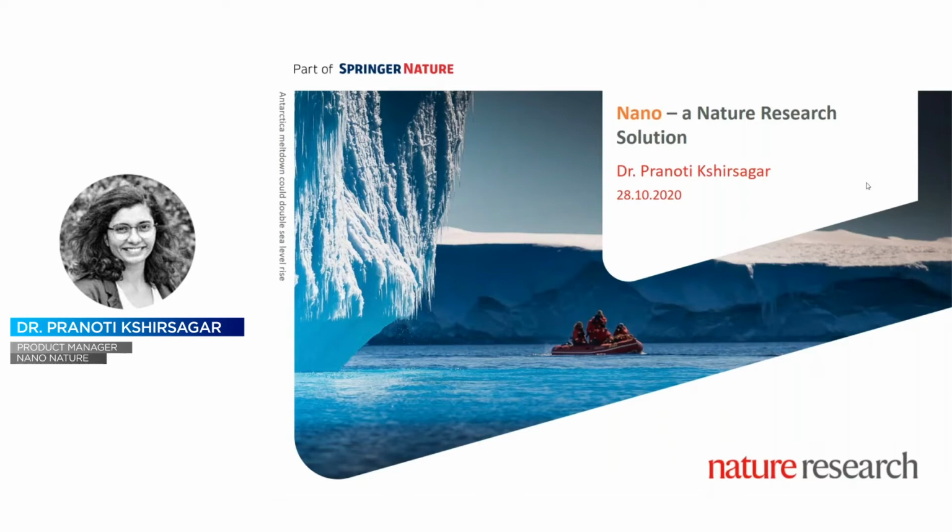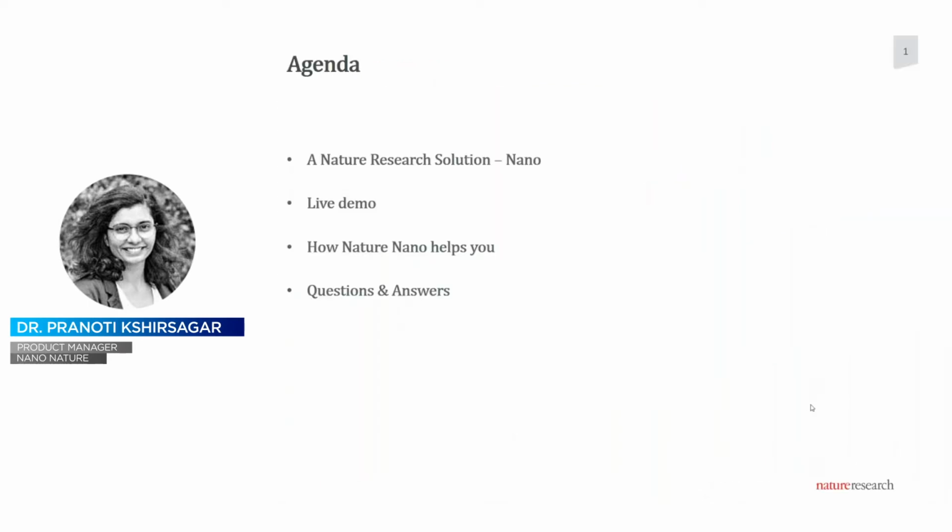In the second part of today's session, what I'm going to tell you about is the Nano database, which is essentially a Nature Research solution. And here is the agenda that we are going to follow. I'll explain to you the idea behind the database, how it came to life, what it offers you. Then we'll do a live demo by going to the URL nano.nature.com.